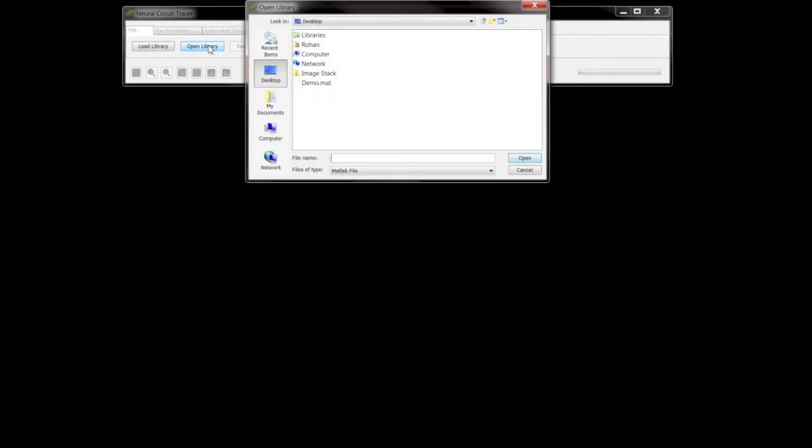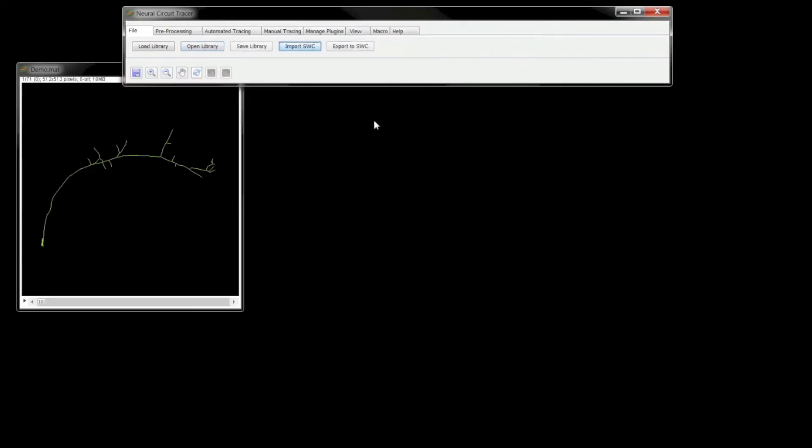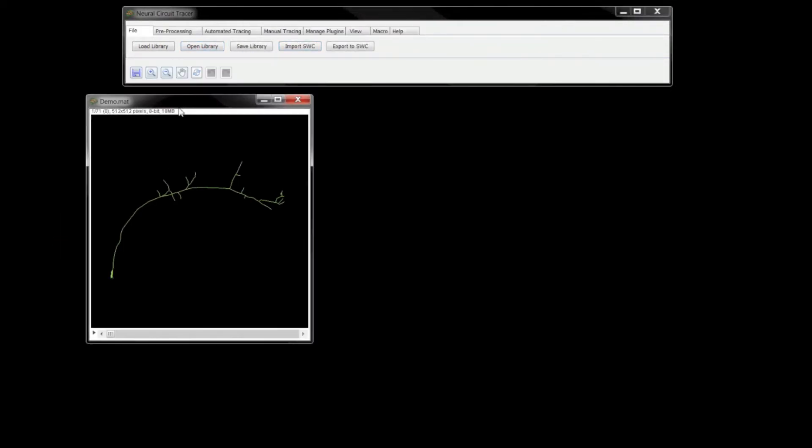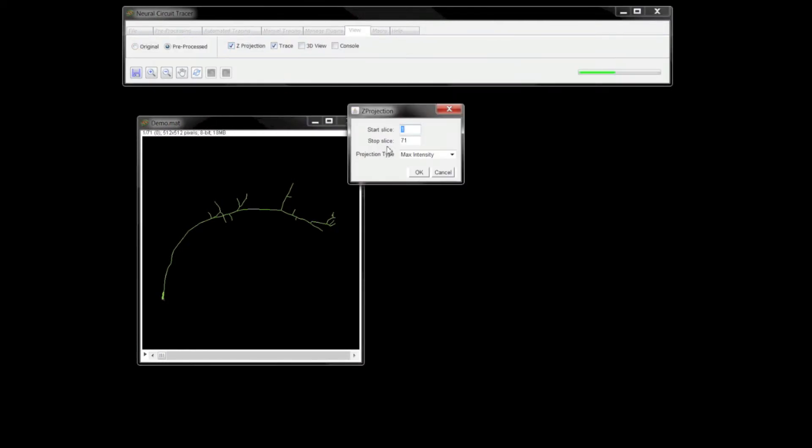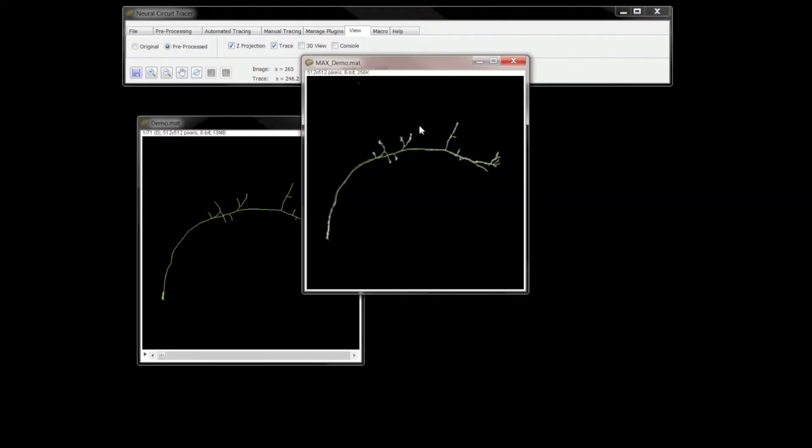Let me load a trace I saved along with an image stack as a .mat file earlier. This is nearly a complete trace, as you can see on the Z-projection where I can toggle the trace on and off.